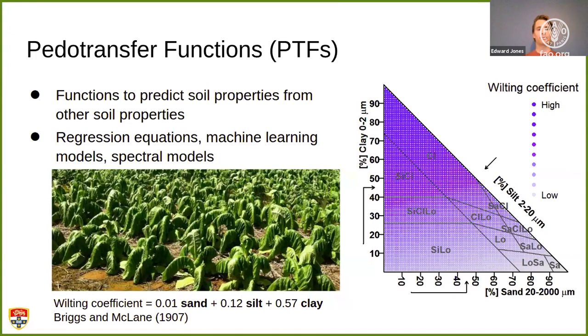The new PTFs we develop are mainly more complex machine learning models or spectral models. But the main thing to understand is that PTFs are the building blocks of SINFERS. And SINFERS uses these PTFs to build relationships, as Alex said, to predict properties that are difficult to obtain using properties that are easier to obtain.